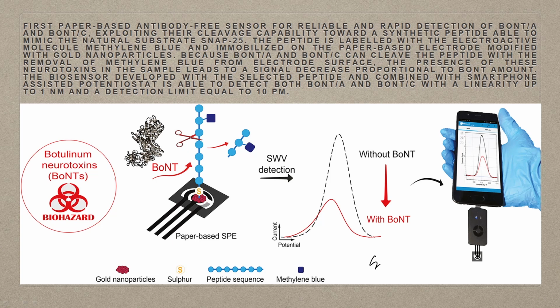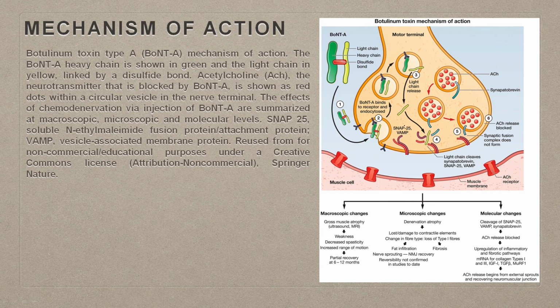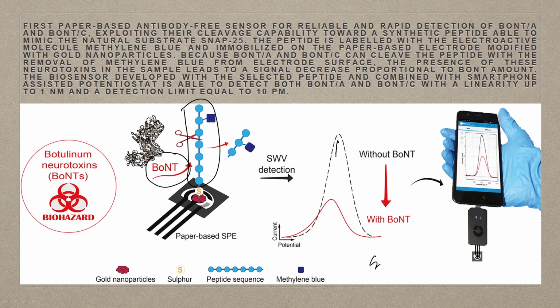In the previous class we talked about how this botulinum toxin cleaves a peptide which is developed from the SNAP25 protein, and for those of you who need to recollect, this is that SNAP protein where the neurotoxin goes and binds, and this is where the neurotoxin goes and cleaves this SNAP protein. So, a peptide is developed based on that, and in this assay the electrical signal goes down, and this is how you figure out that botulinum toxin is functional.